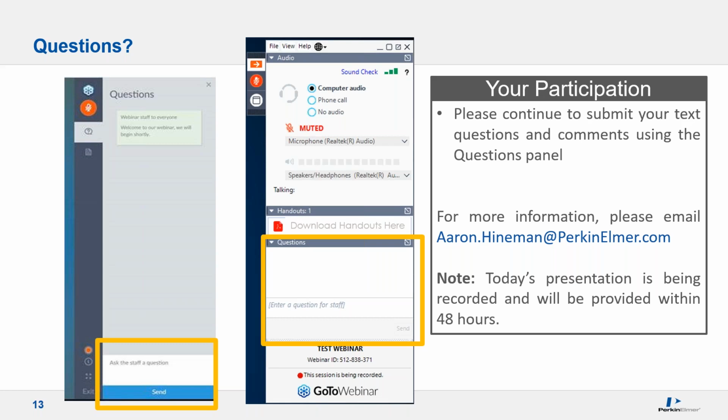What is the typical amount of overlap that separates an IEC-only correction from one that could be handled by MSF? That's a good question. IEC can correct for either partial overlap or direct overlap. If you end up with a peak that looks like an M, that would be a partial overlap, so that's a case where you could use MSF or IEC. If you have a direct overlap, so you basically see a single peak in your spectra that contains two elements, then you need to use IEC. If there's any semblance of there being two peaks, any kind of M shape, then MSF should work.